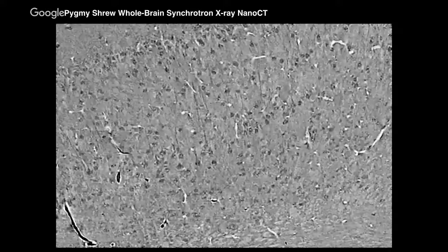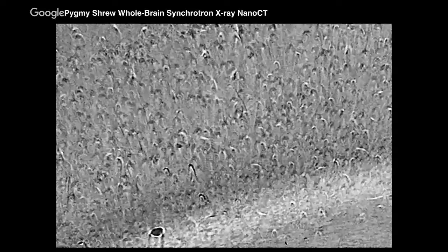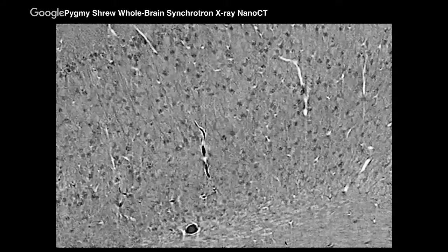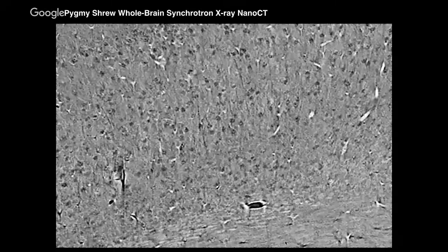So the resolution here is submicron. It really is nanoscale. It's closer to half a micron. And this is showing cortex in the upper part, and then at the very bottom right, you see the external capsule, the white matter, coming into view.